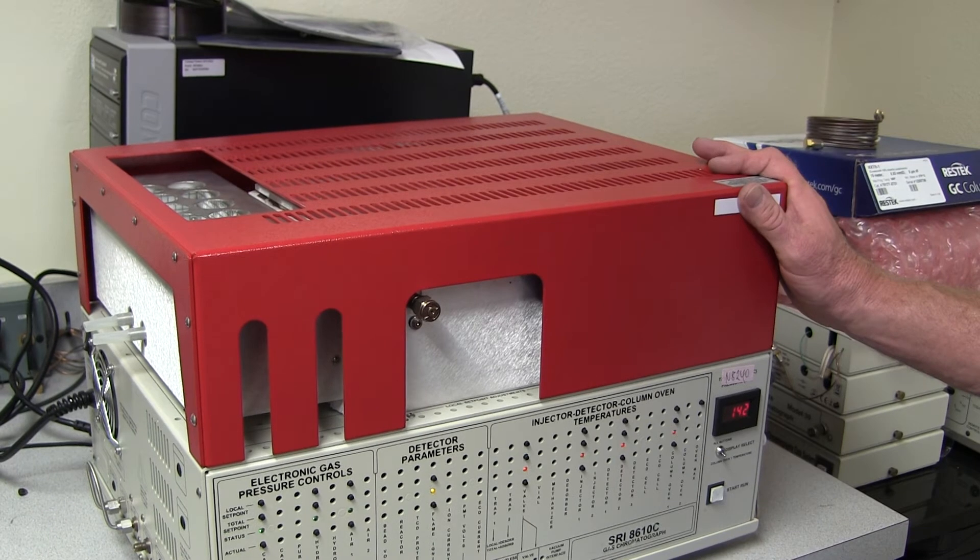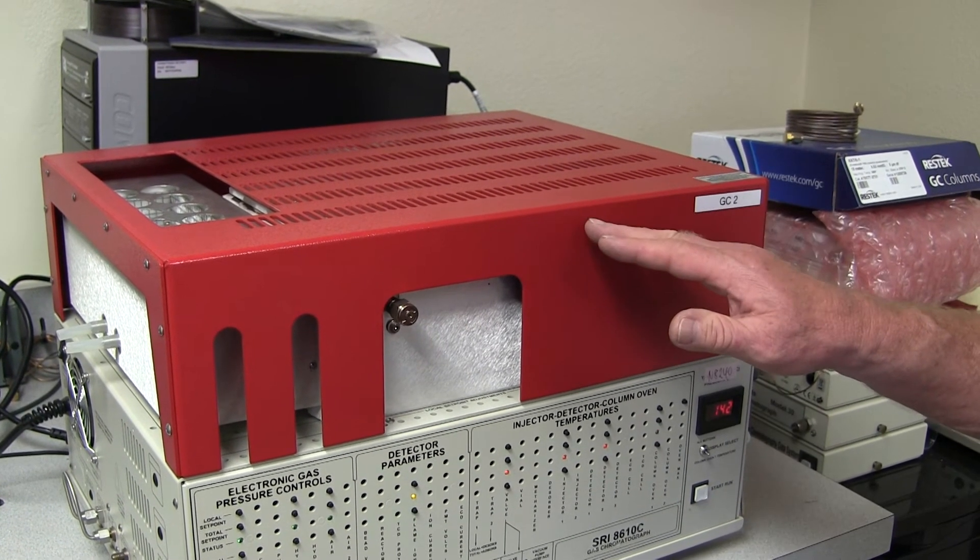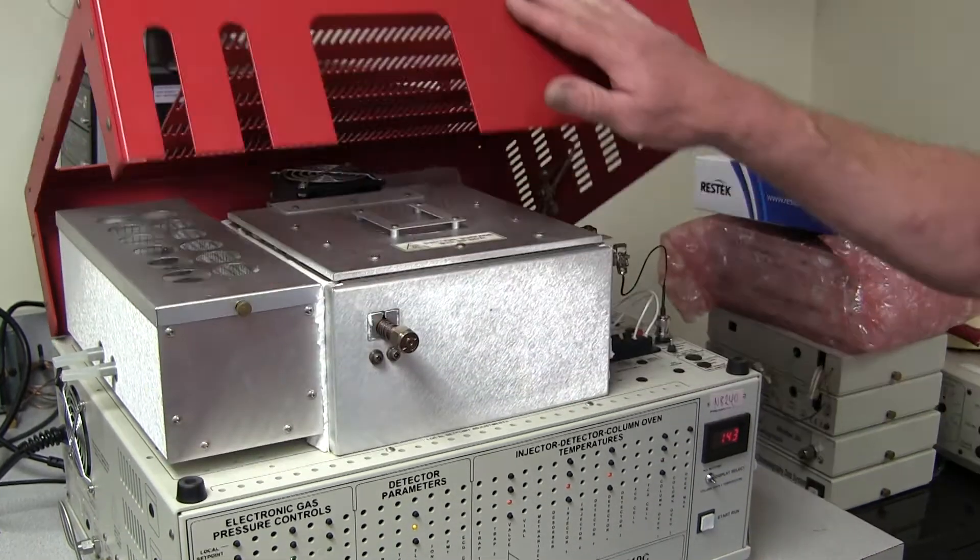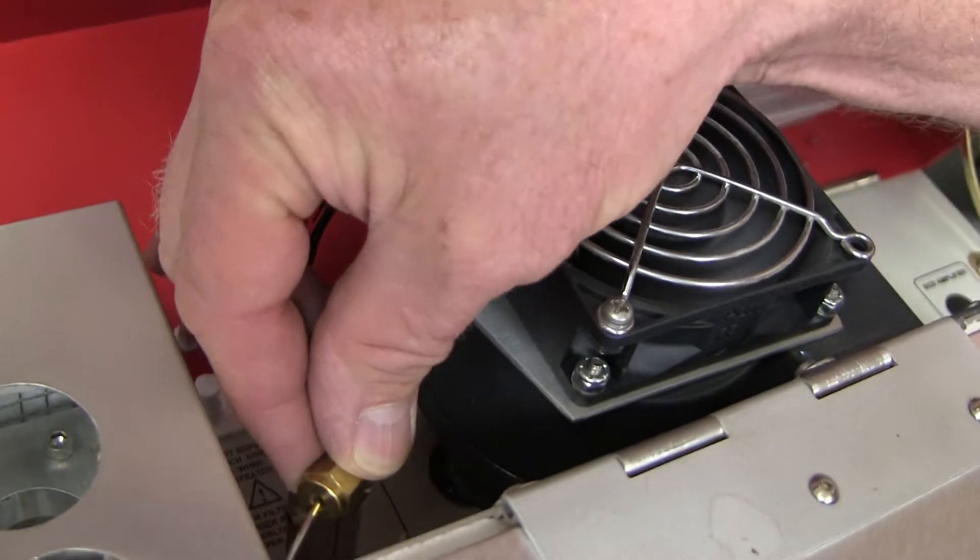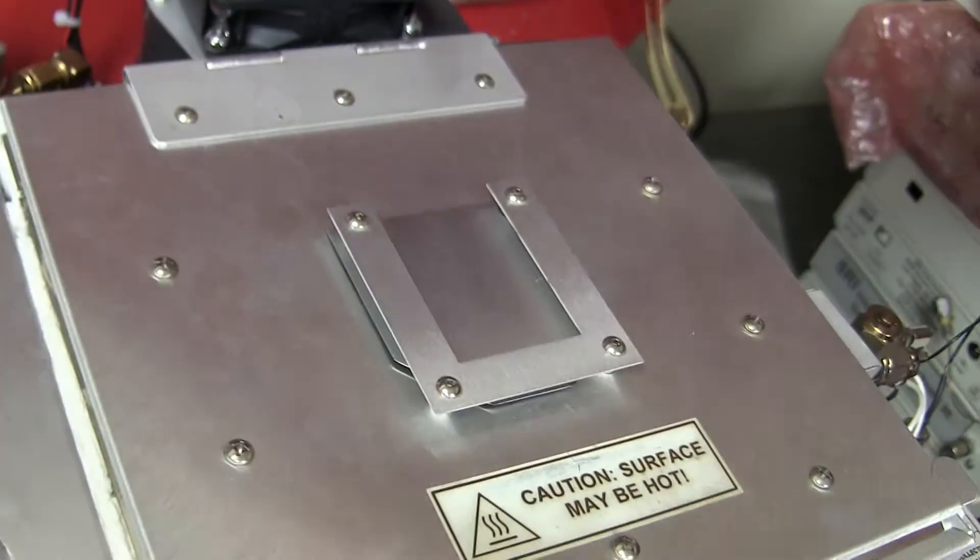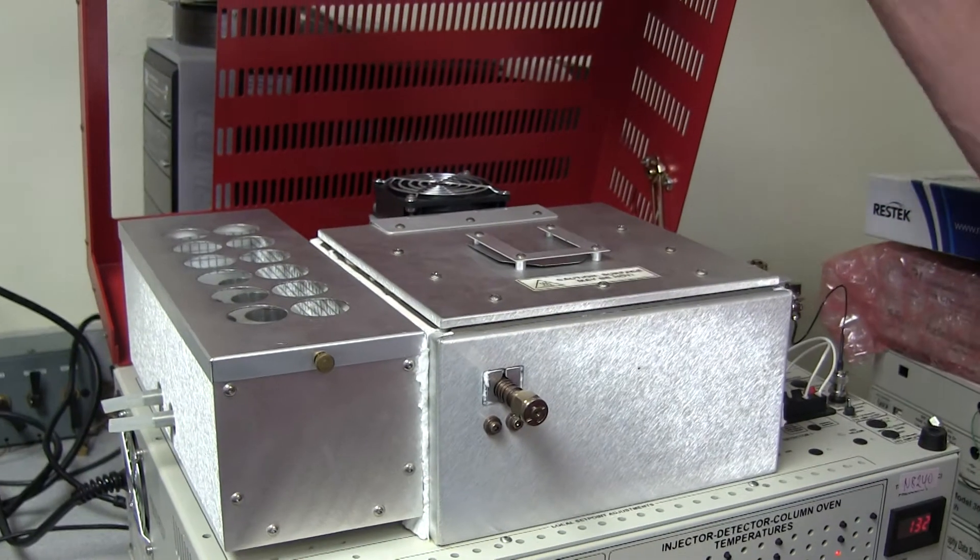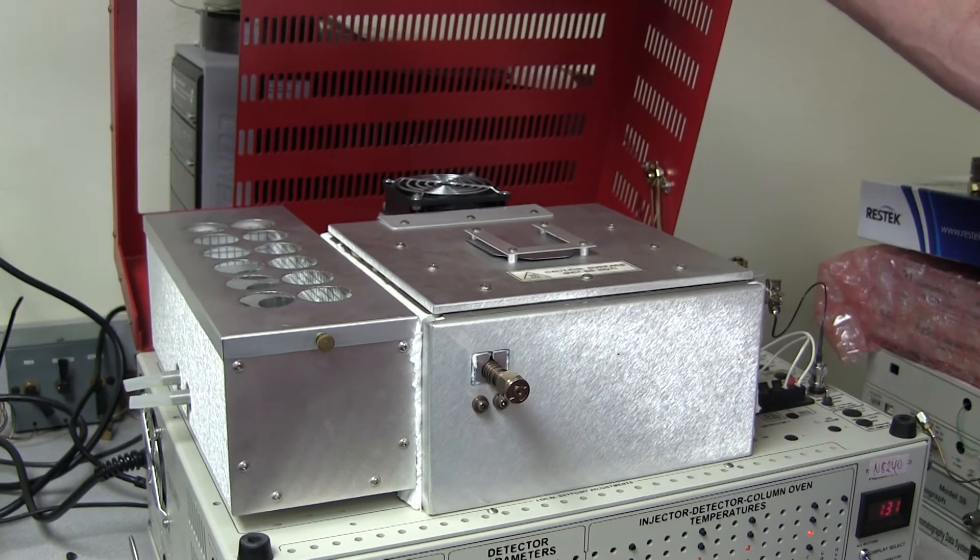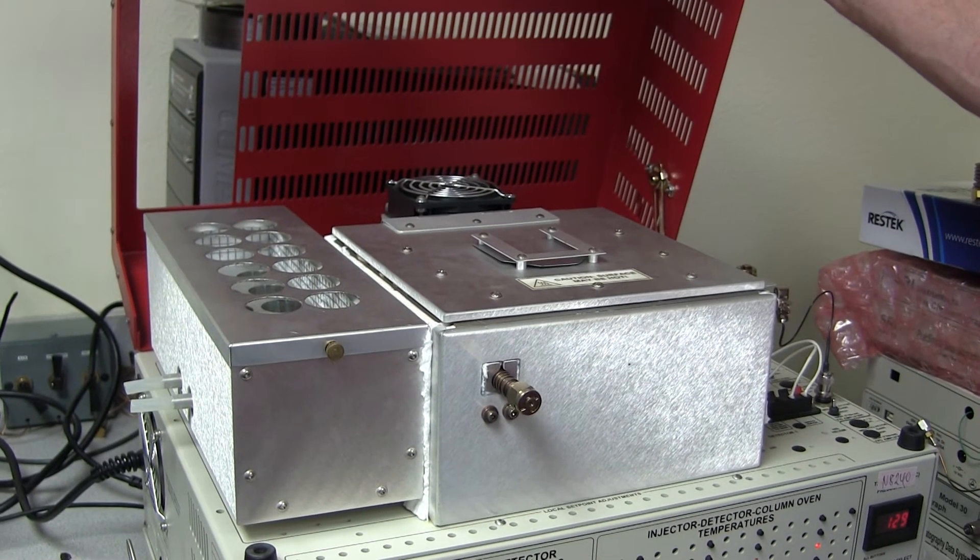One definition of baking out is to clean out the polishing filter on the GC. SRI builds a little filter into the GC, which is located immediately behind and to the left of the column oven. This filter catches impurities in the carrier gas as it flows through. It also catches little traces of machining oils and debris that's left over from putting the GC together in the first place.